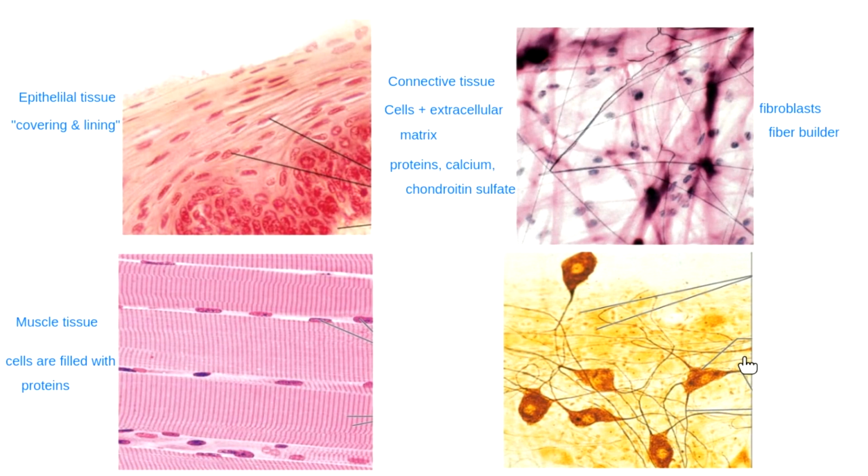And then finally, my last example down here is nervous tissue. Nervous tissue has two types of cells in it. The first type of cells, which are the big ones, are the neurons. I like to call those the thinking cells because they're literally the ones that help you think. But the nervous tissue also has what are called neuroglia. The neuroglia are these little tiny dots, these little cells that we see around here. Their name literally means that they're neuron helpers. And that's the job of these cells, to help my neurons do the thinking or the processing.